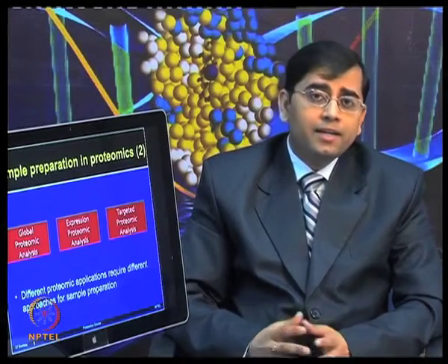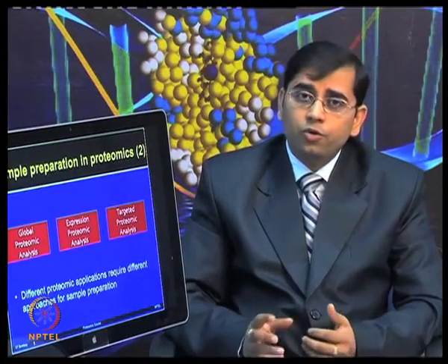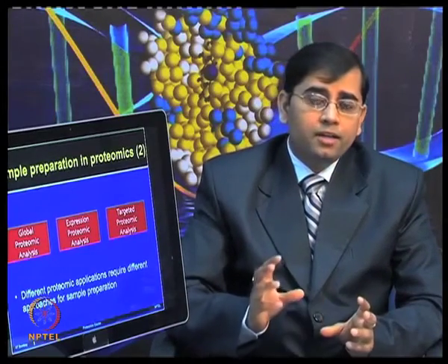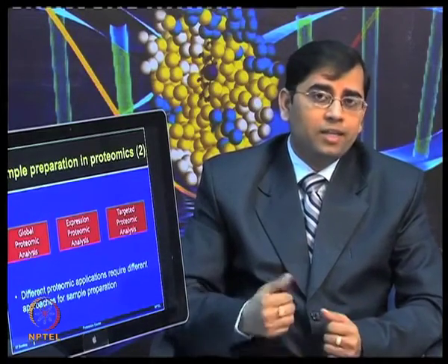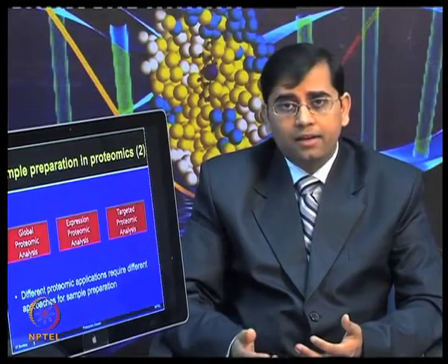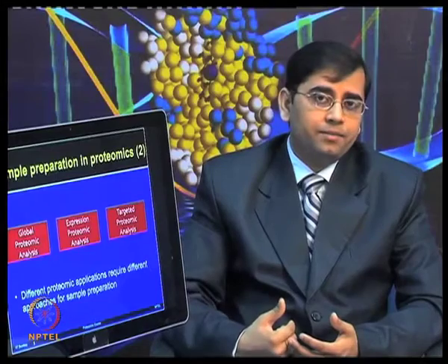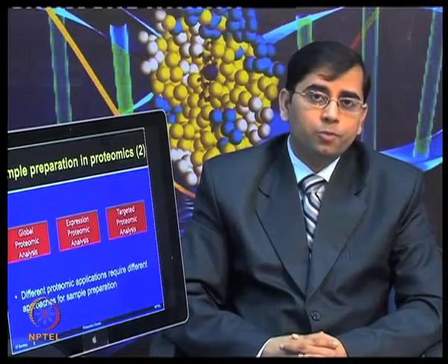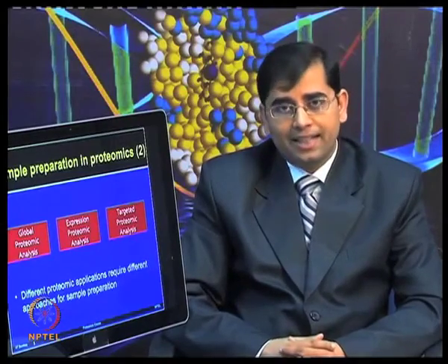Now, when you are looking at targeted proteome analysis, you want to pre-fractionate your sample in such a way that only that particular component is isolated and then all the proteins from that organelle or cell are extracted. So, different types of strategies need to be used to perform these types of proteomic analysis.